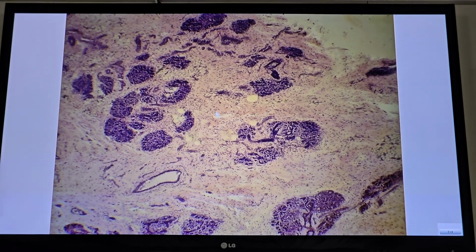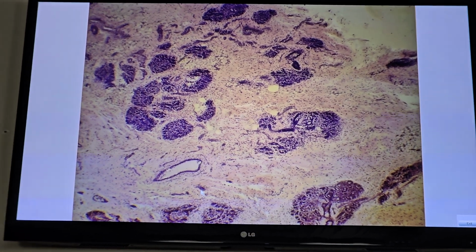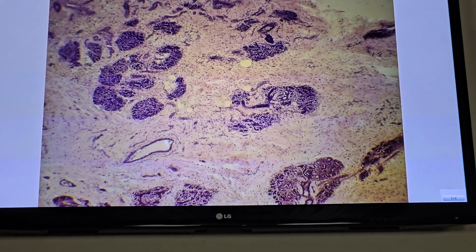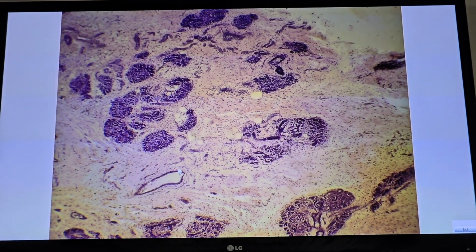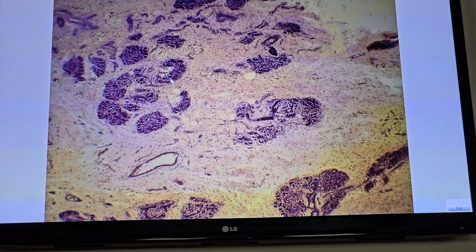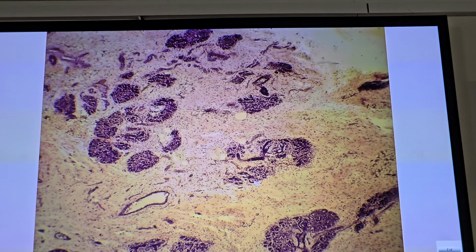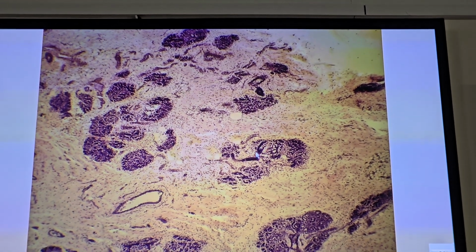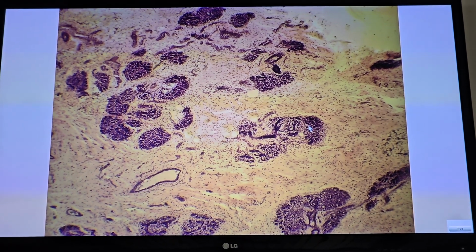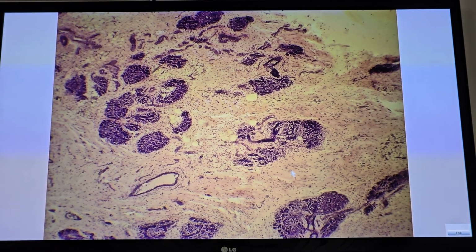In non-pregnant adult women, each loop consists of the ducts with very small or rudimentary secretory units. Duct portions with very small or rudimentary secretory units in non-pregnant adult women.